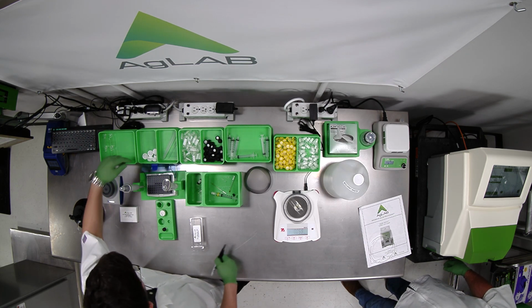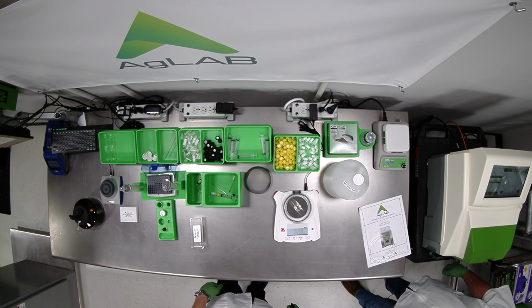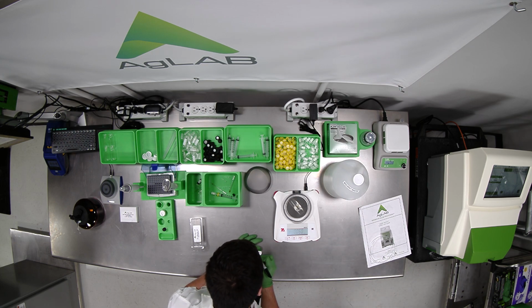Okay, we'll go with 6. These balances can hear you, so. Okay, 59. So our D1 is going to be 0.059 grams.